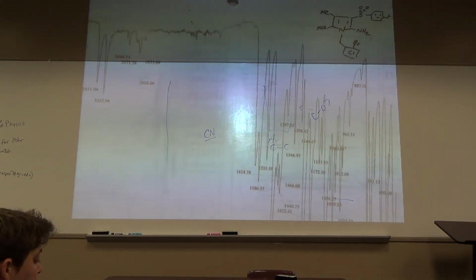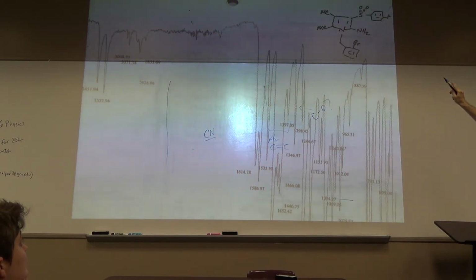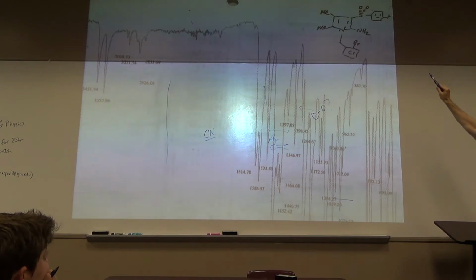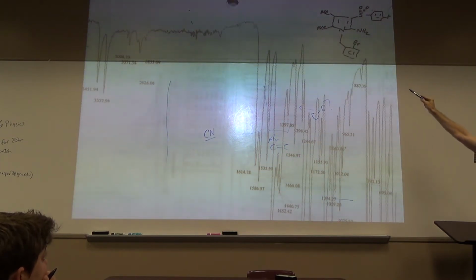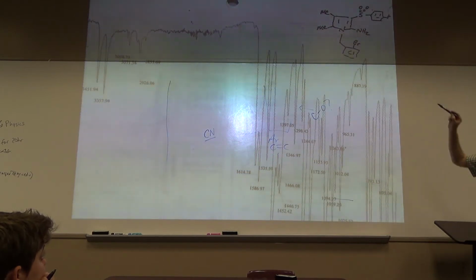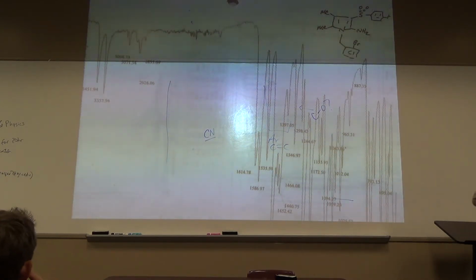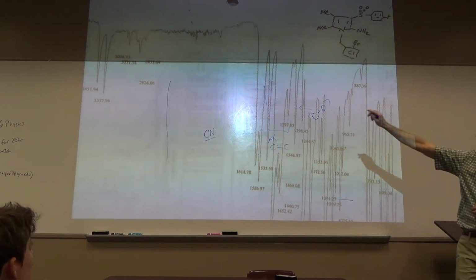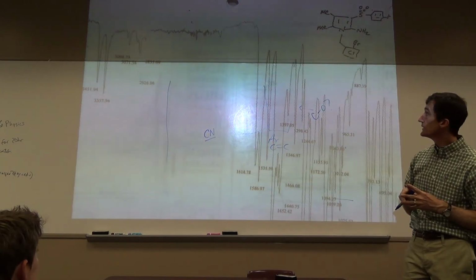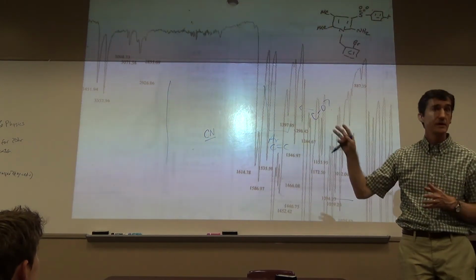These compounds were made for then doing something with that. The next step was to have the nitrogen displace the bromine, have the nitrogen bonded to the carbon instead of the bromine, with the goal of making a new ring. This is an IR of the starting material. It has an NH2. Does it look like an NH2? Yeah. You can try to interpret some of the rest, but there's your NH2.